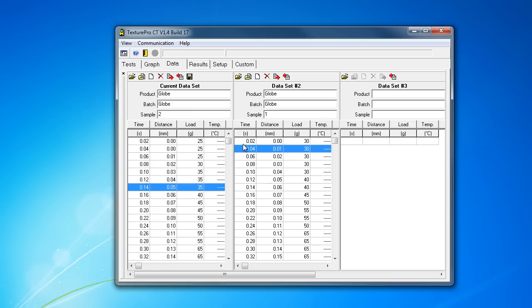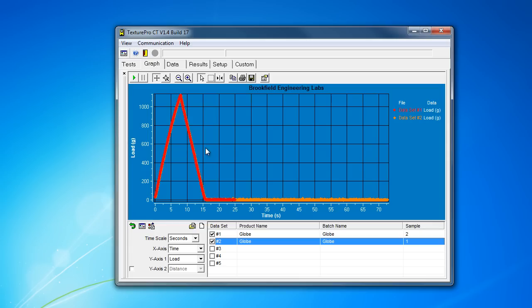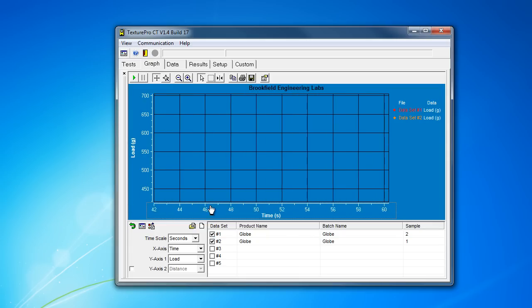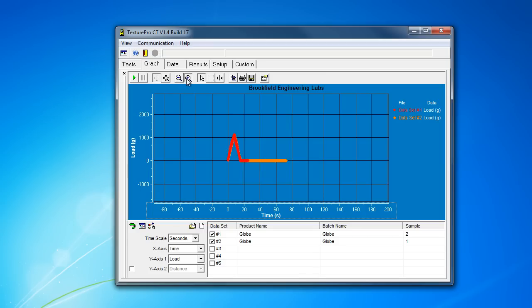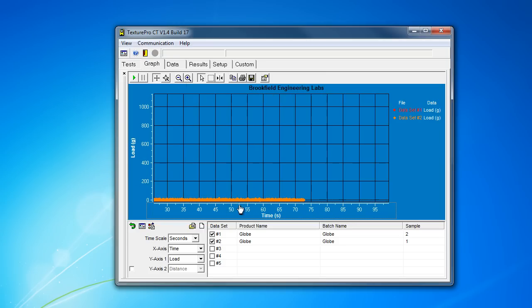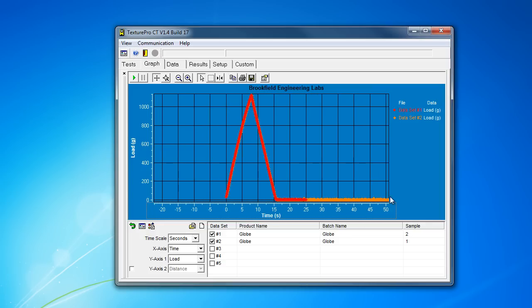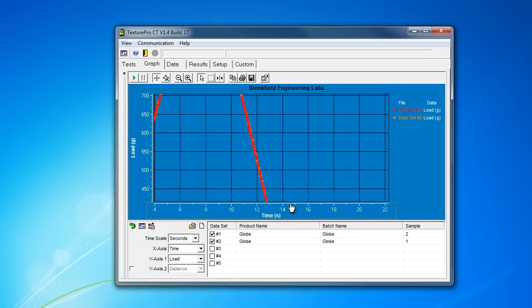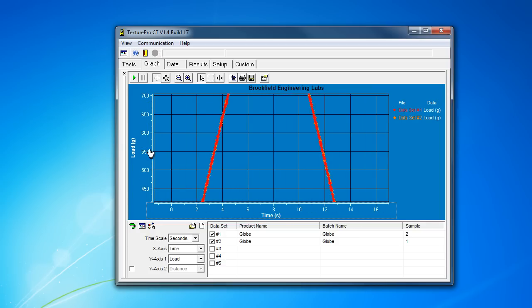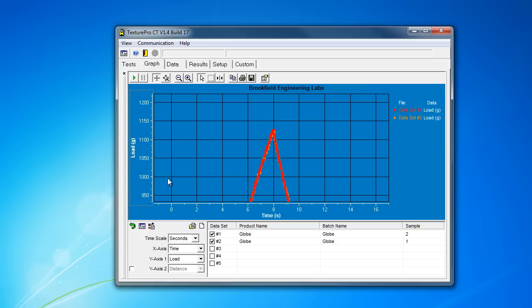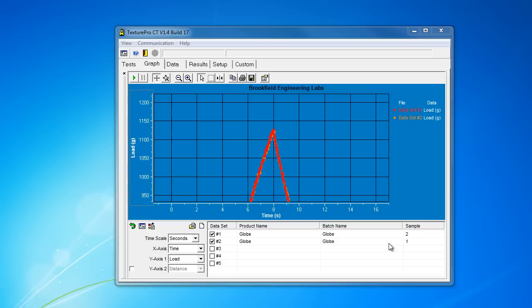Once we've loaded in two, I've got two replicates. And you'll see that it will in fact draw them both on the graph. However, it's still not very useful in terms of being able to compare the two very much. The nature of a texture analyzer and the purpose of buying a texture analyzer is to make comparisons between products, between tests, between different plants, to make comparisons over time, to make comparisons over formulas, over competitors. And the fundamental flaw of the software is that it's not doable.